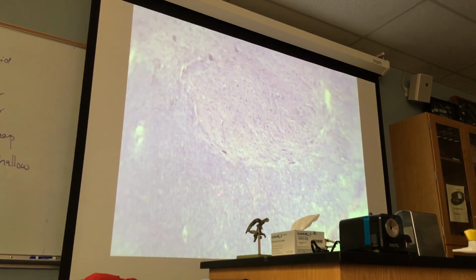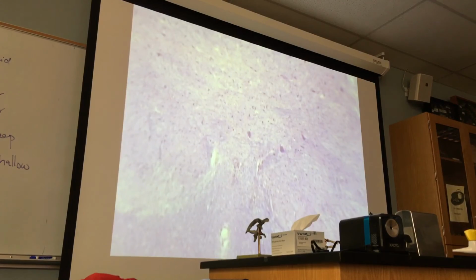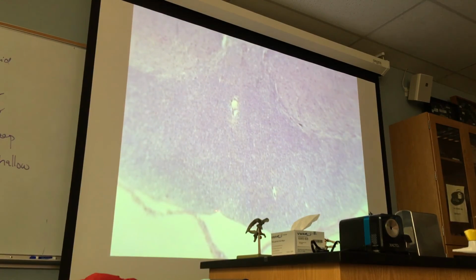This is dorsal side. And look here, this is very shallow, and you can see the dent here, isn't it? That is for the posterior median sulcus. Okay? So what is this side?